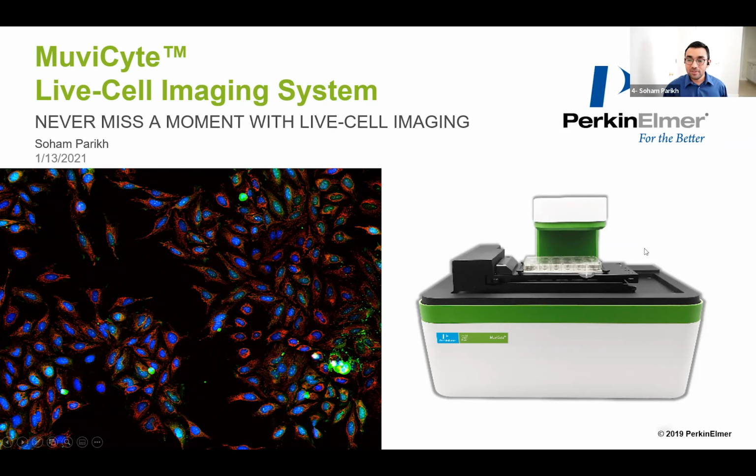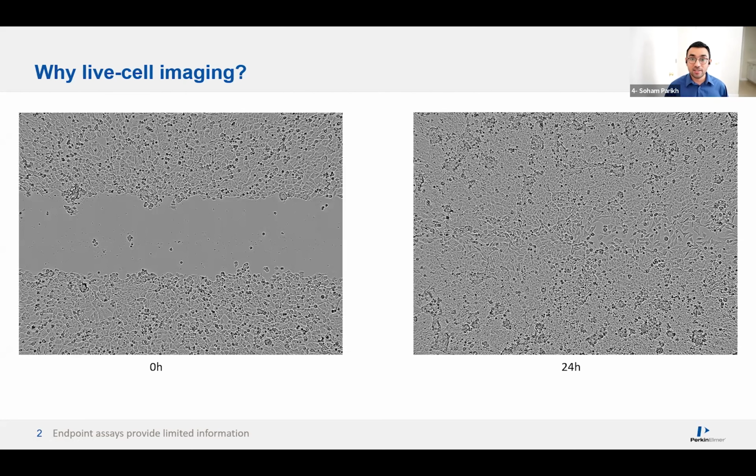As you can see, this is how the MuviCyte instrument looks. To walk you through all the features and capabilities of this instrument, I wanted to start off with some basic understanding, because we have companies at MBC. Some companies are already established in their cellular imaging workflows, and I've talked to several of you, and some companies are right now starting their cellular imaging workflows. I wanted to make sure that everybody's on the same page. So I'm going to start with a very introductory look at what live cell imaging is and why this instrument could be important for your workflows.